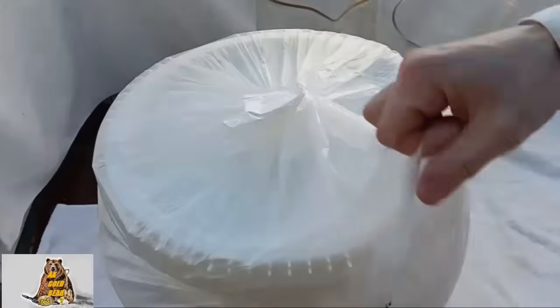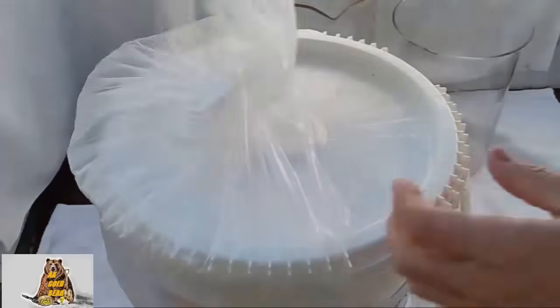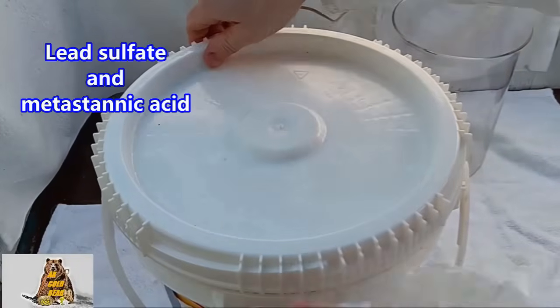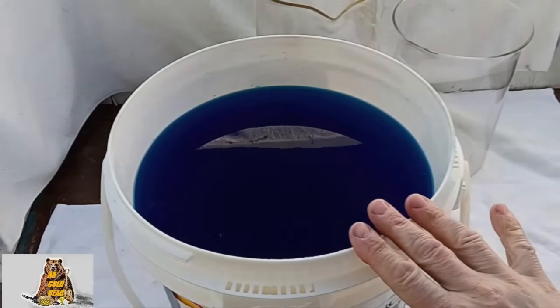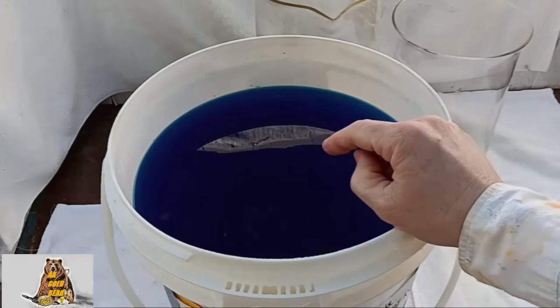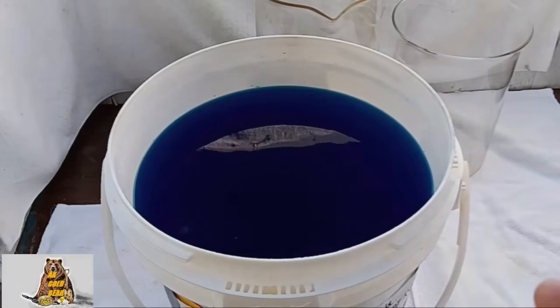I kept the copper nitrate in a bucket for 3 days. Now all the chlorides, sulfate, and metastannic acid should be at the bottom. Excellent! Clean blue color — this is exactly what I want. All the dirt at the bottom. Now I need to evaporate a lot of water from this copper nitrate.